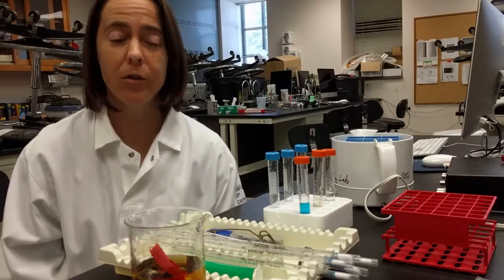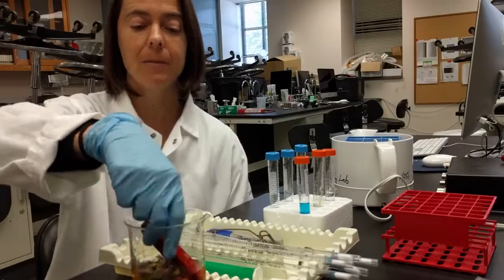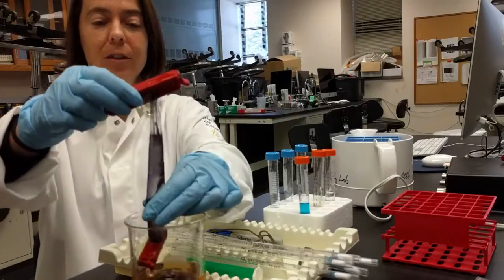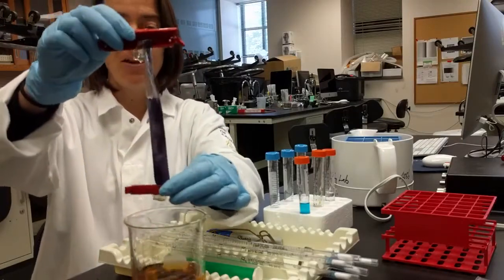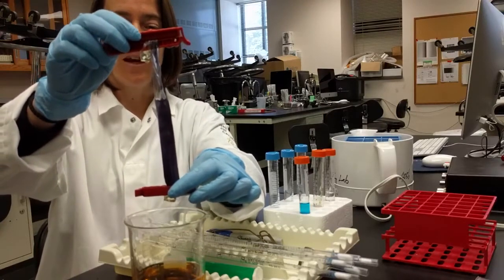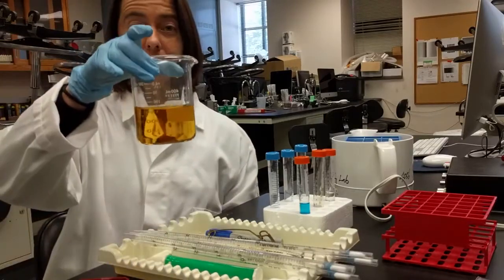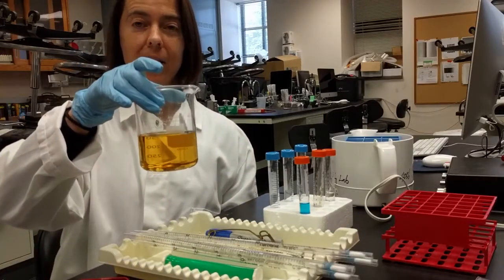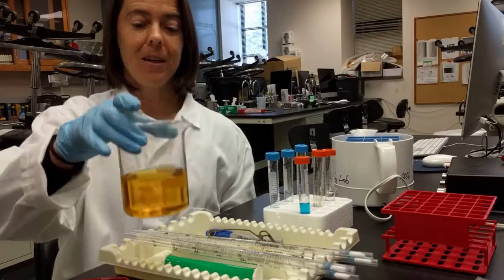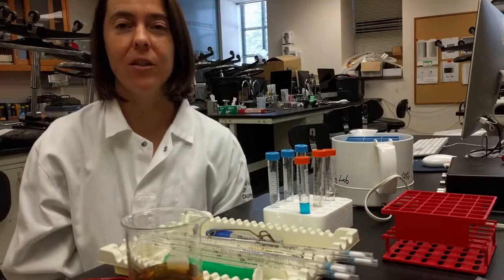Okay, it's been about 30 minutes. Let's take a look at our beaker and bag. So this is the bag. Okay, so make note of that color. Write it down in your table. Okay, so that's the bag after 30 minutes. And then this is the beaker after 30 minutes, so make note of that color as well. Okay, so that should give you some information about the I2KI and the starch.